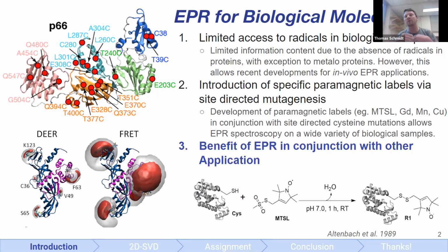In many cases, we need to introduce this paramagnetic species, and we do that via a specific engineered cysteine, where we attach a covalently linked paramagnetic label, such as a nitroxide. As a final result, we hopefully get a large library of labeling sites. To visualize how that looks, here we have a rather rigid protein labeled with our paramagnetic labels, and you can see how the rotamers distribute the label.